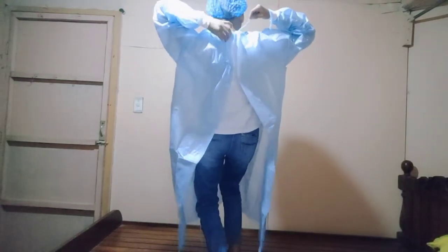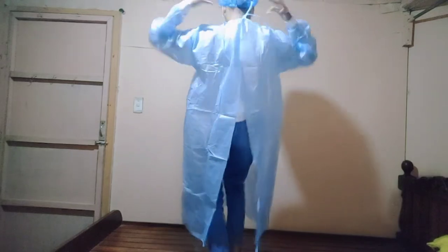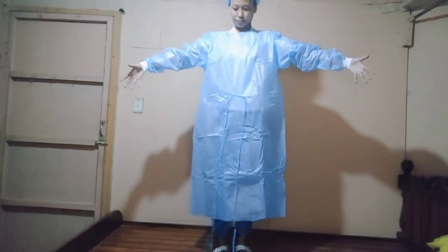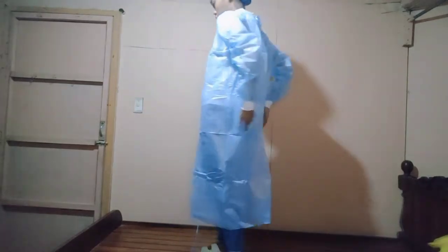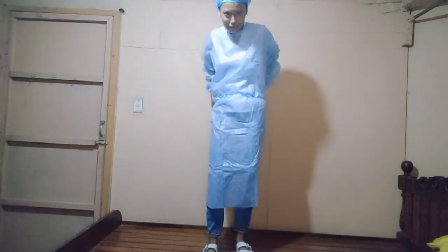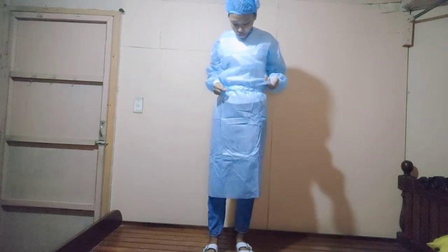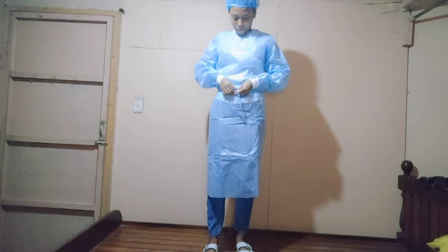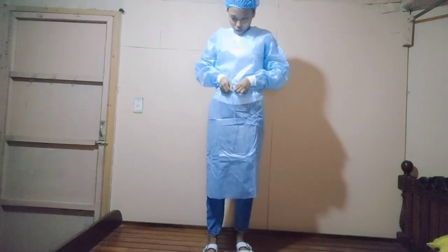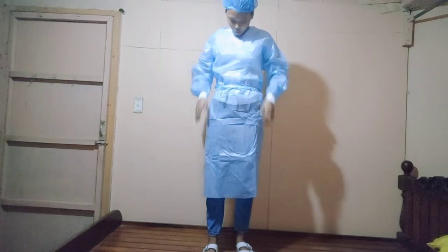We have to tie this at the back. I hope you can see it — I'm trying my best. So we have to tie the belt, overlap, and tie the belt. It's fine if you tie it at the back or in the front — I prefer to tie it in the front for ease. Next, fasten the waist tie or belt. All done.